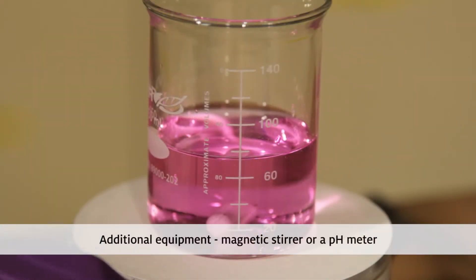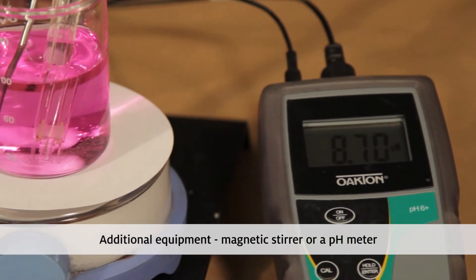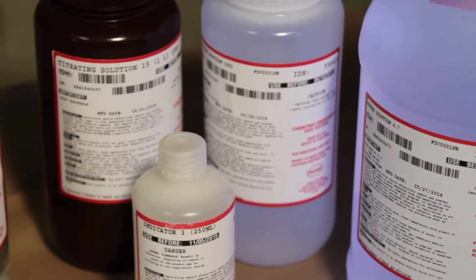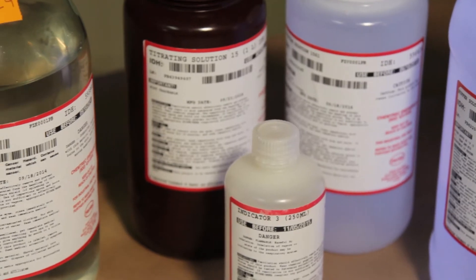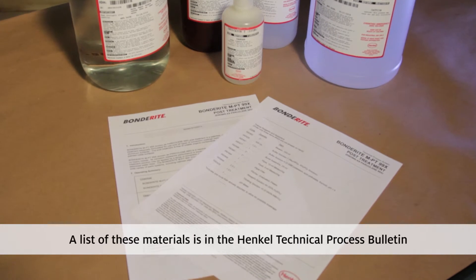Some additional equipment, such as a magnetic stirrer or a pH meter, can make your testing simpler and easier to do. Test solutions for the product you are using are also required. A list of these materials is on the last page of the Henkel technical process bulletin.